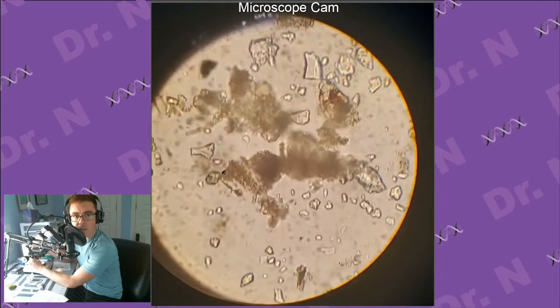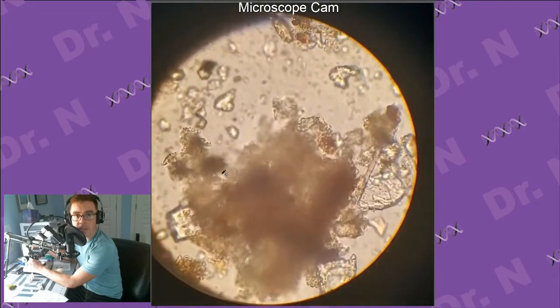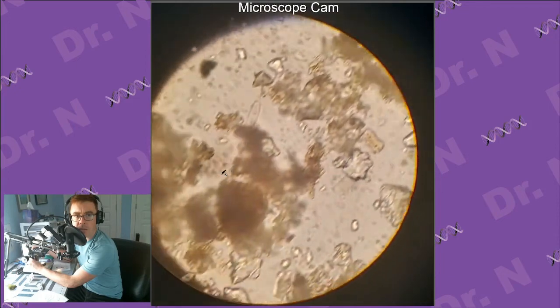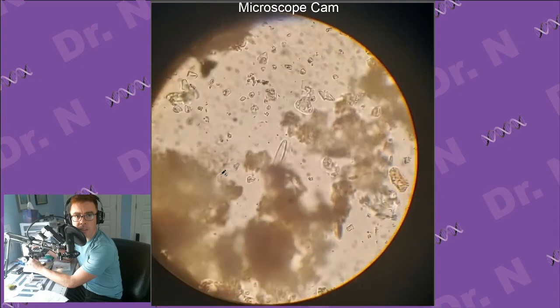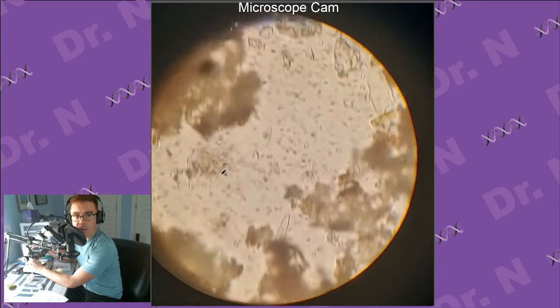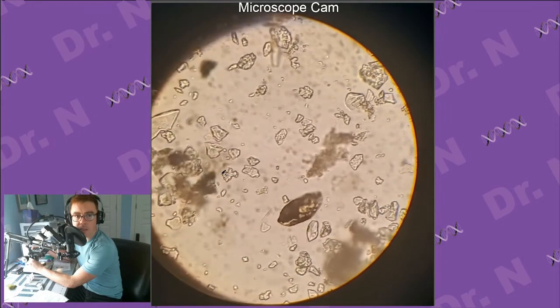Since most of this is just dirt, it's going to be cell debris, bits of insects, bits of plant. Also just inorganic things like pieces of sand. There's another, right in the middle there, there's another one of those cells that we saw before. Oh, hello. So that clear rod-shaped thing, I'm just pausing on it to see if it's going to move. Whenever I see an elongated oval or an ellipse, that always makes me think paramecium. But it doesn't seem to be moving. It could still be, it's just either dead or just deciding not to move.